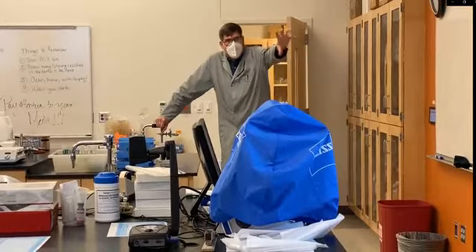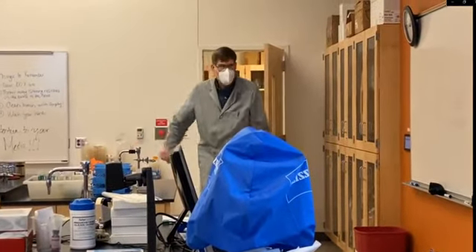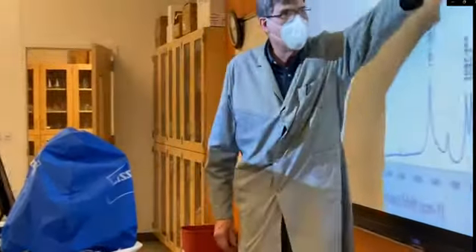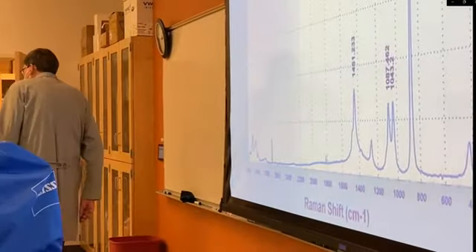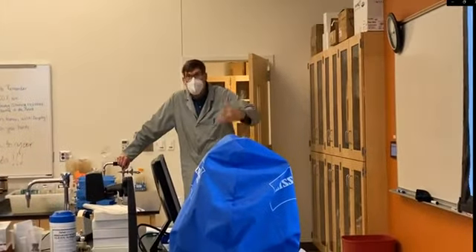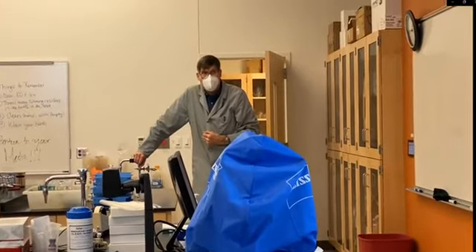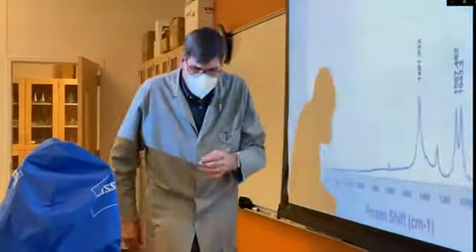So you can see the spectrum of ethanol is a pretty simple spectrum. And so we have a limited number of bands. The bands are quite sharp and they do not overlap very much. So that allows us to do just a simple XY regression, a simple linear regression between concentration and the intensity that we measure at 875 wave numbers.